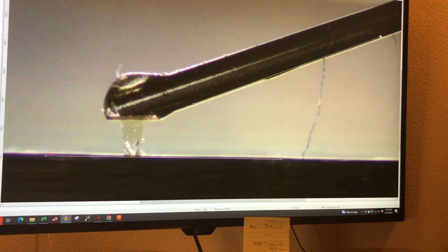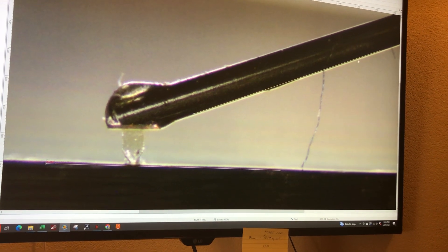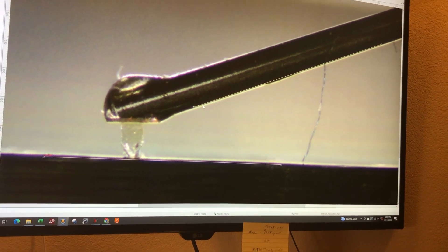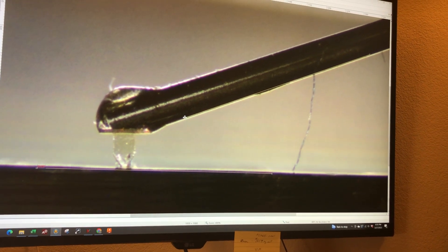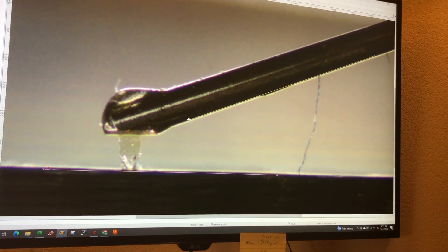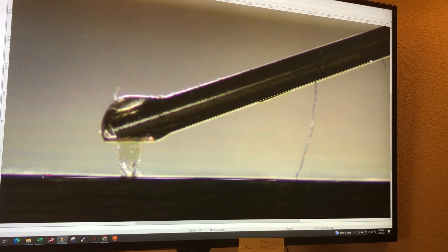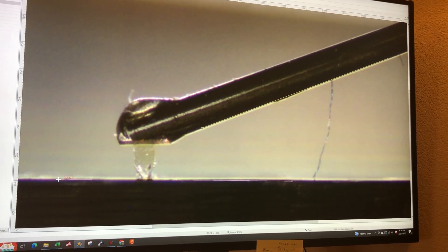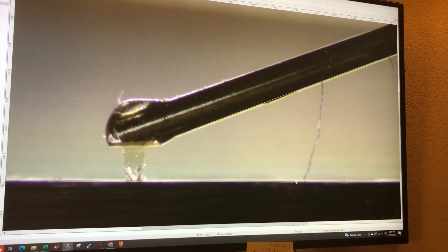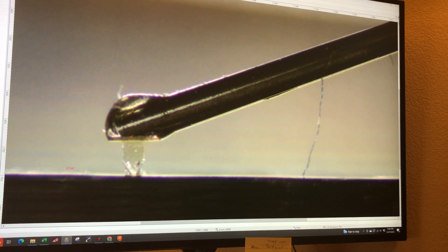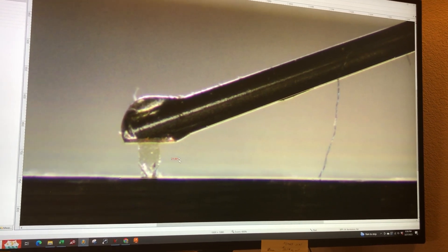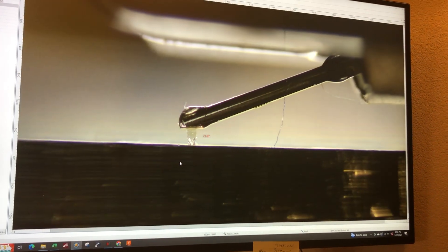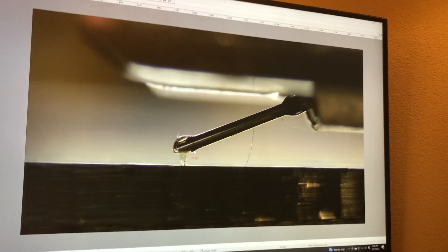Now I can align these alignment marks. I like to when I align keep some margin of the cantilever on the measured side of the measurement line. I want to see some margin. I don't want to completely cover it up with my measurement line because then it'll be a little difficult to make sure that I'm staying right on top of it. Do the same down here, again I leave a little bit of a margin. And that's a good line, here's my reading right there.